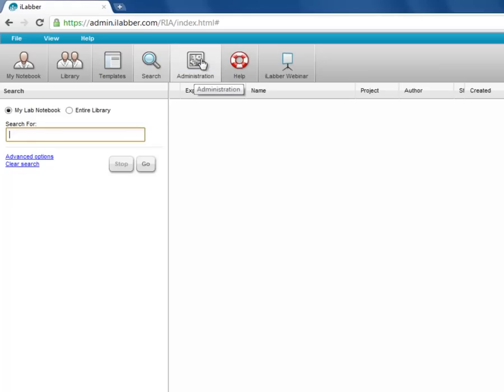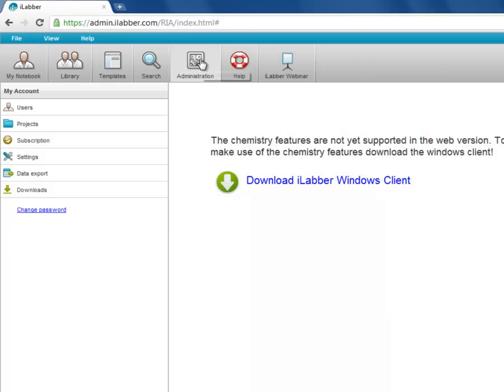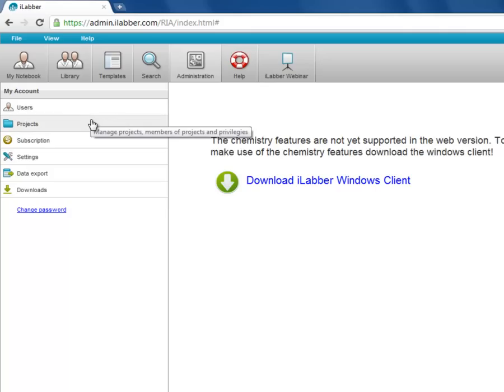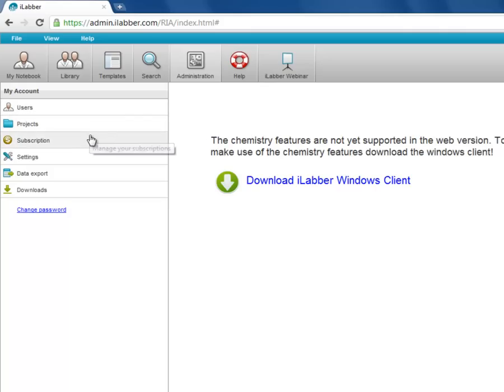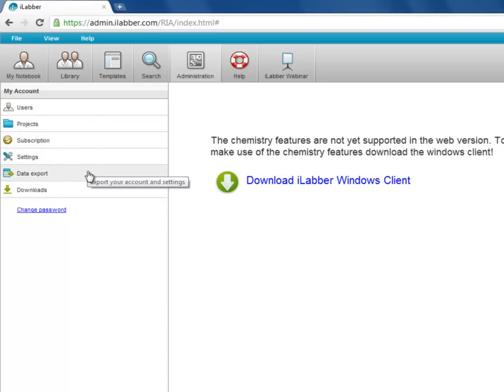The fifth button is the administration page. Here you can come to edit users and add new users, edit and add new projects, extend your license to iLabr, and export data if you want to export your iLabr experiments to store locally.